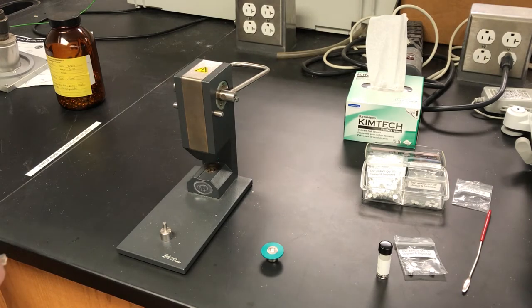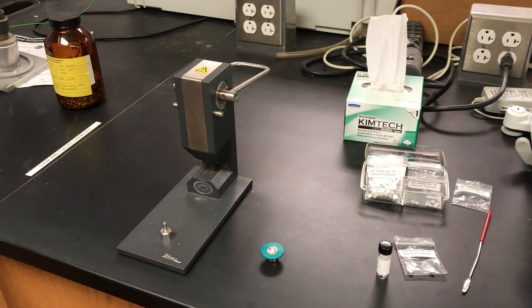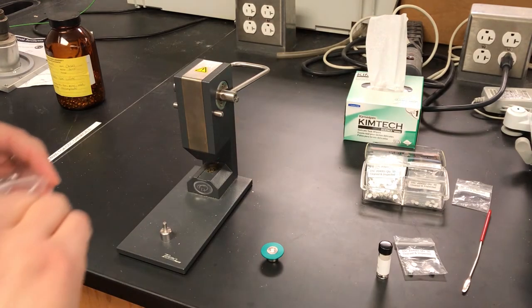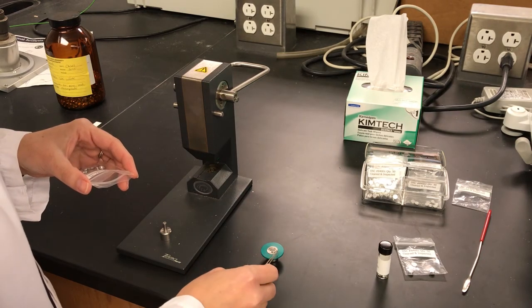So I just put the sample pan down. And at this point, if we were running a sample, we would put the sample in. And then the lid goes in, goes on top with the concave side down.